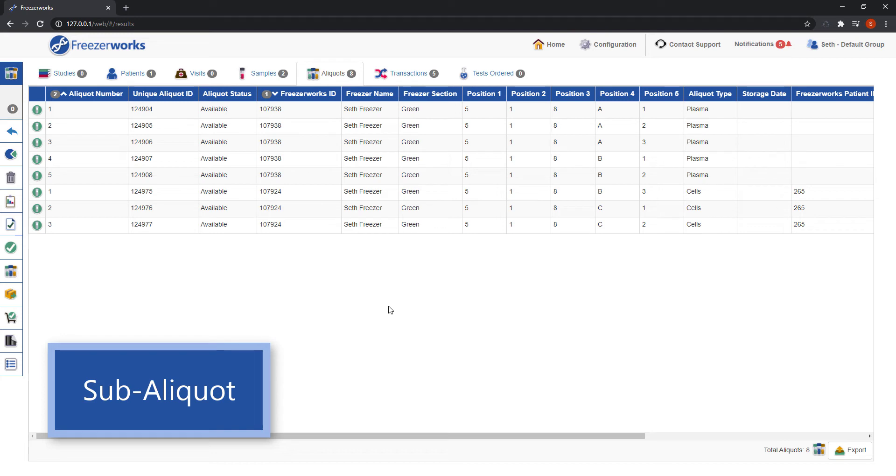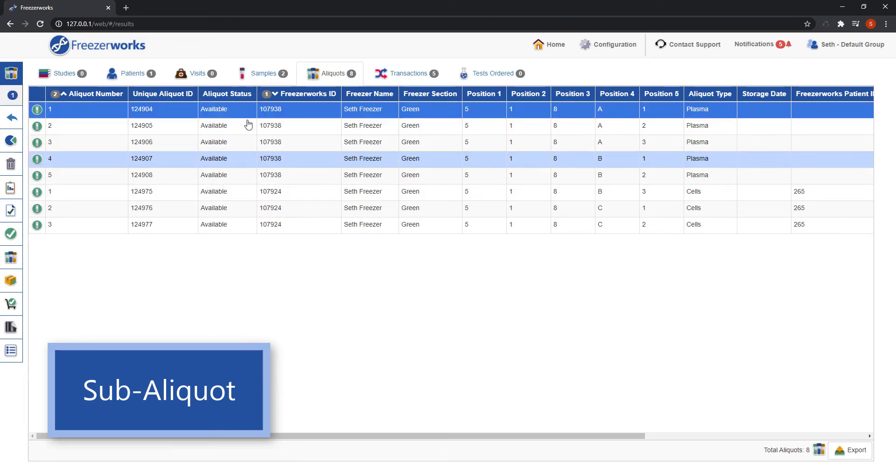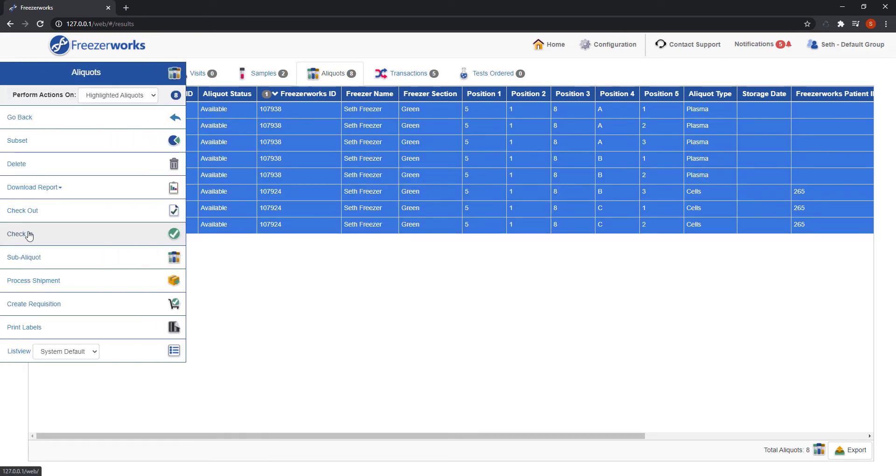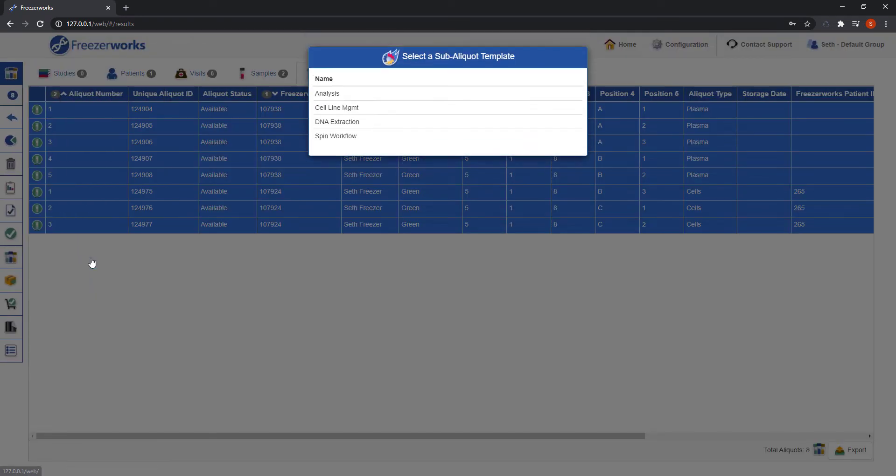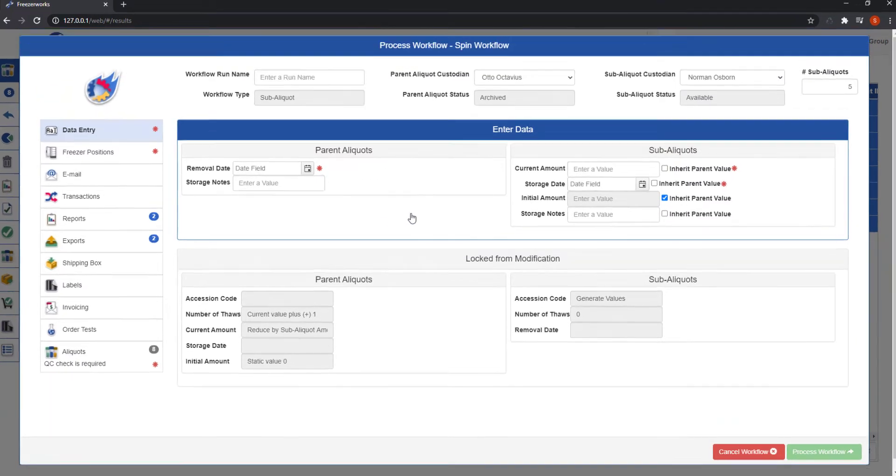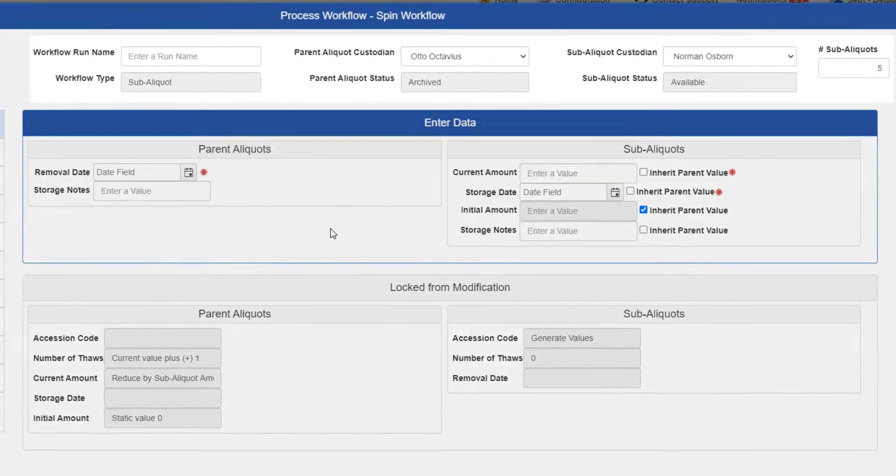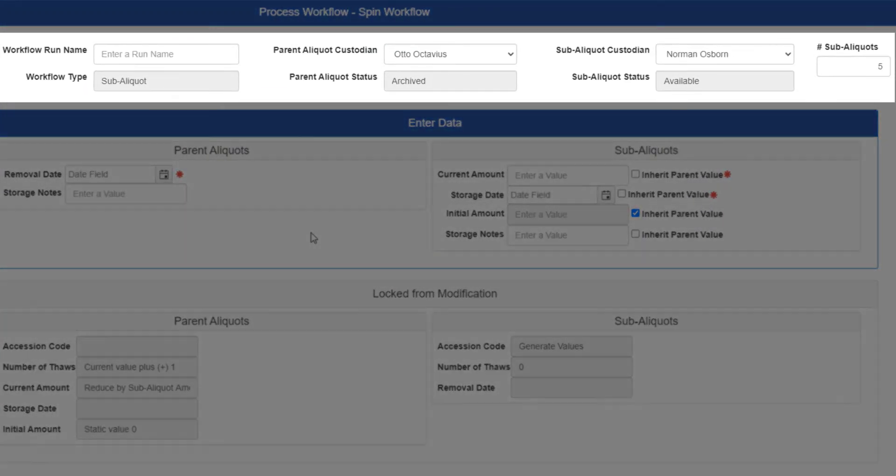Highlight the aliquots, click sub-aliquot, and pick your template. Sub-aliquot workflows can appear pretty complicated, but if you understand checkout and check-in, this won't be too difficult. First, your top bar will have more fields.